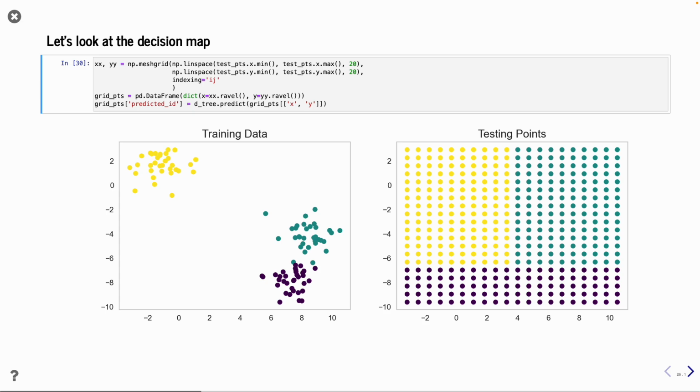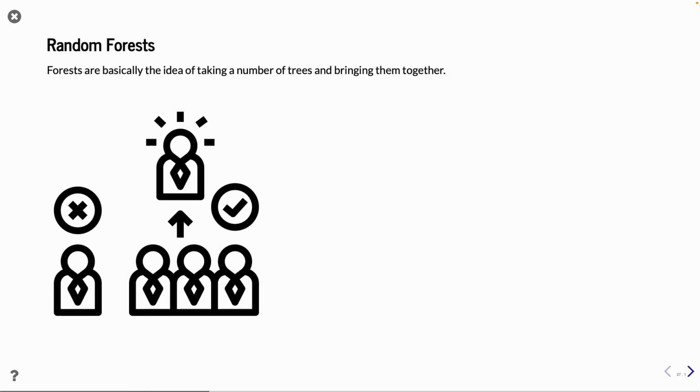So let's try something else. We can also do random forests. So if you have one tree, it's a tree. If you have many trees, it's a forest. So what is happening here is we actually do many trees, train them on different sub-data sets, and see what happens. And then we do it the Swiss way. The majority wins. So you ask these trees, which is the strongest choice? And that is what assigns the class.